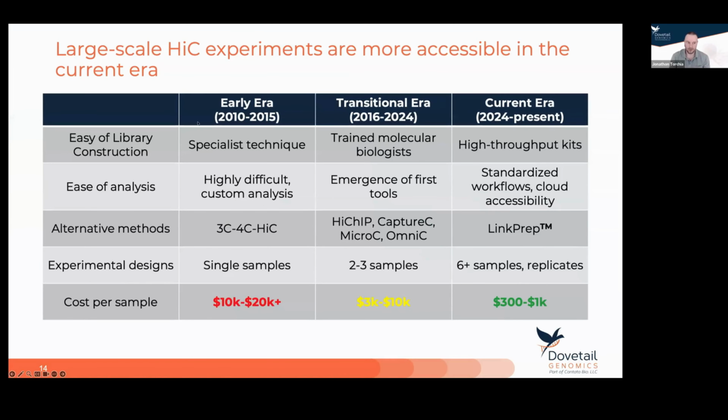Great. So what I'd like to do with the second half of our webinar is highlight some of the challenges that we've had internally as well as in the field for differential analysis, how we've chosen to address these challenges and solve them, and hopefully go through an example using one of the projects that we had internally in our lab, actually showing you what the types of analyses are available through the report.